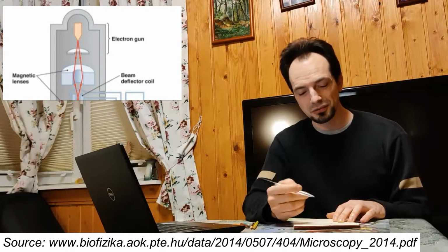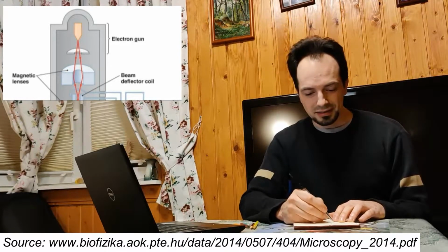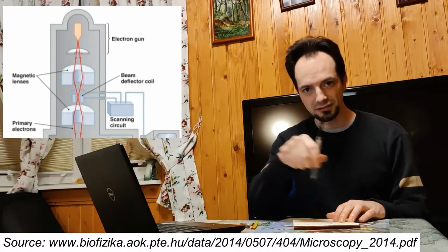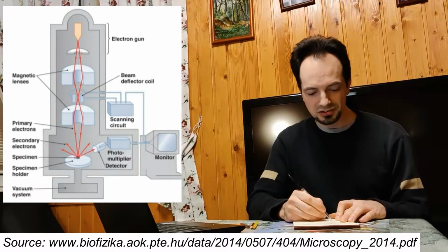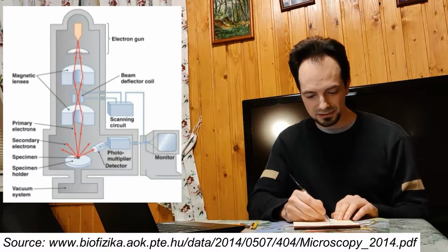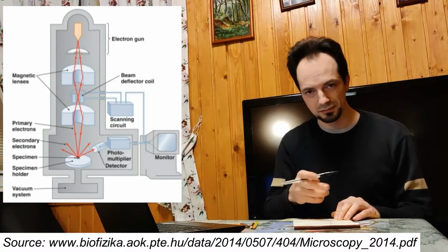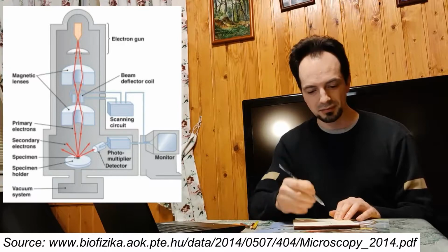In an actual microscope there are a lot of lenses and apertures, but I will draw quite simple here. The almost final stage are some coils, magnetic coils, that actually shift the beam, the coils that deflect the beam and enable that scanning motion. The final stage is the sample stage, the table on which the sample sits. Usually the table has controls of movements in 2 or 3 axes and rotation maybe in some devices.